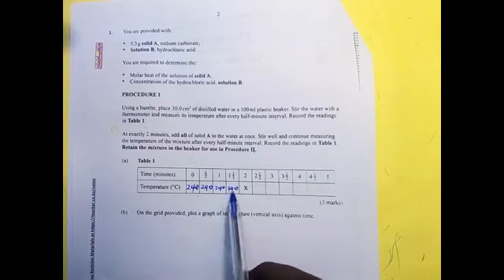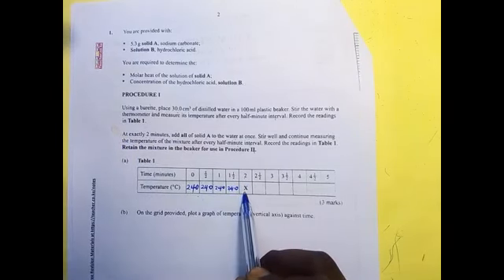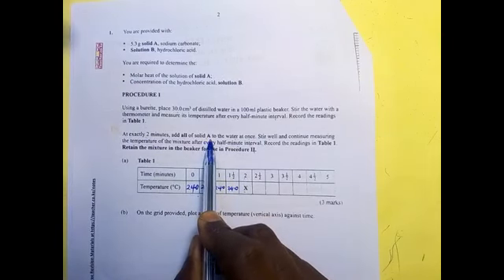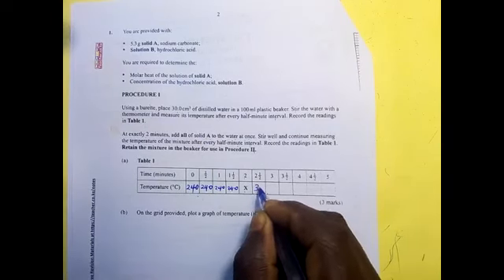Now when the time is exactly 2 minutes, you can see 2 minutes where there is X, you add all the solid A at once. From that, the temperature will start rising or decreasing, it depends. But for this one, the temperature was rising. The first one was 31.